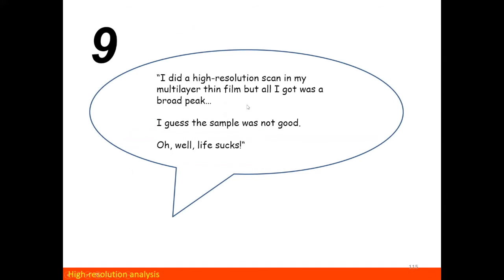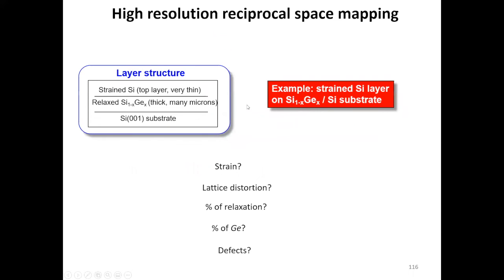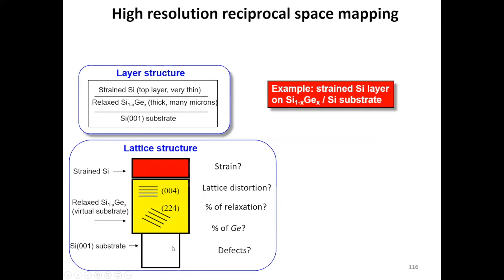In fact, this is similar work to what many of our students who graduated from our lab did, and they're now working at Intel. So in this case, they did high resolution work, and they said, look, I saw this blob of peaks. I cannot identify too much of what is going on here. Perhaps my sample is bad, you know, I don't have anything more to do and tell about this.